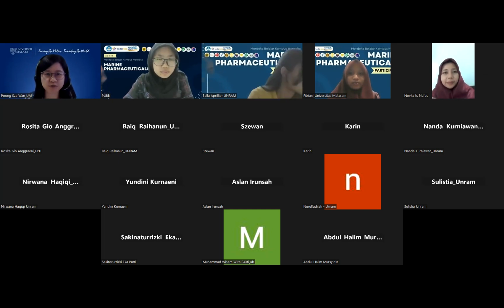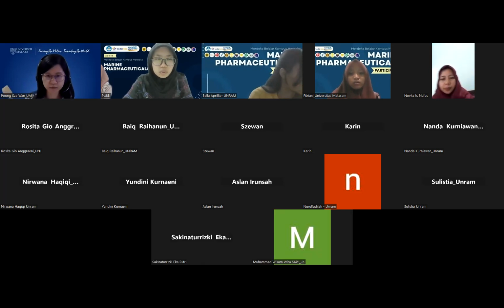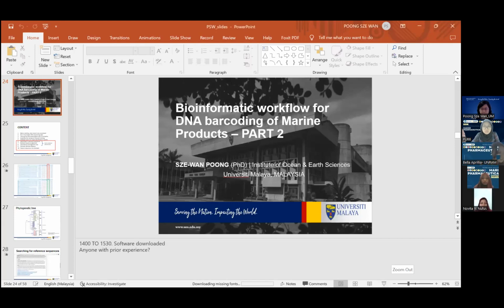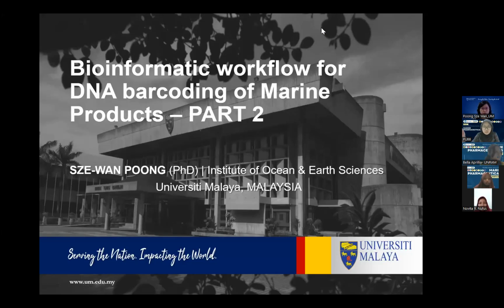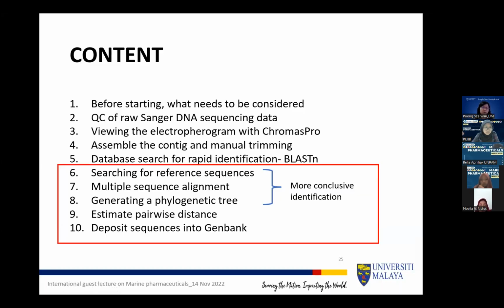Right, so good afternoon to everyone here. This is the second part of my lecture. We had the first part last Monday. Let me share my screen. I think everyone can see this right now. Last week we did the first 5 topics. We stopped at how we search GenBank or NCBI using the sequence that you have generated. That is for rapid identification.